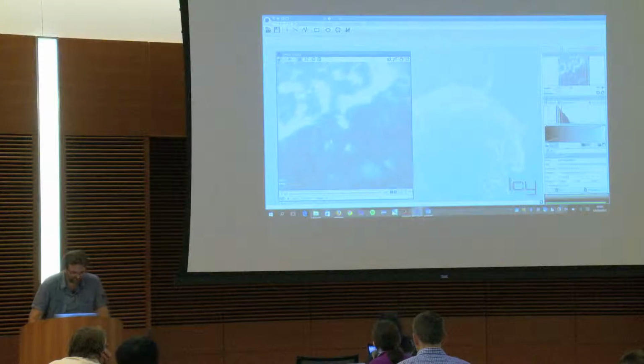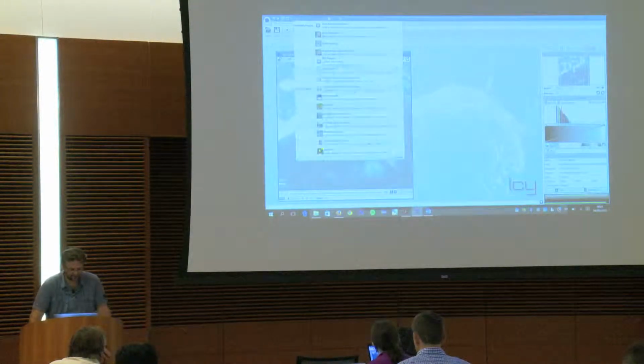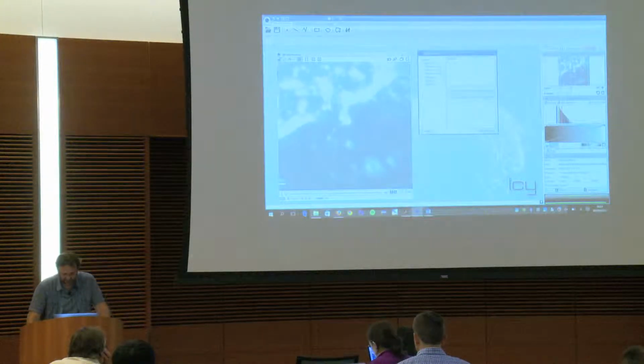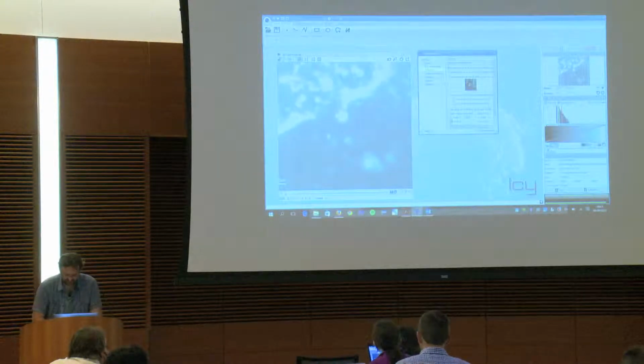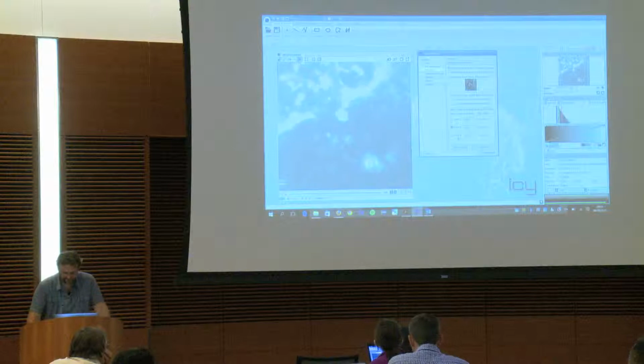I like my logic. And here I will first need to make a spot detection again. There's another plugin that I was just mentioning. Here I will need to detect this thing. The sensitivity I will put much higher, I don't even remember, let's say this.